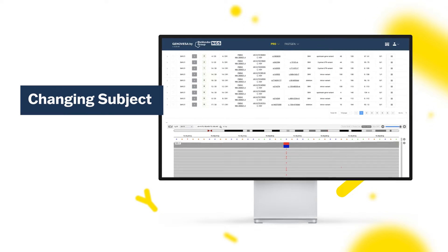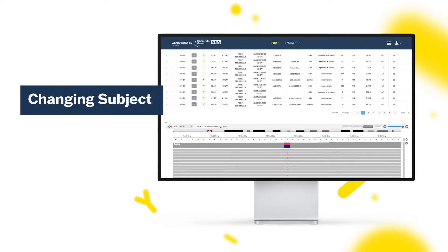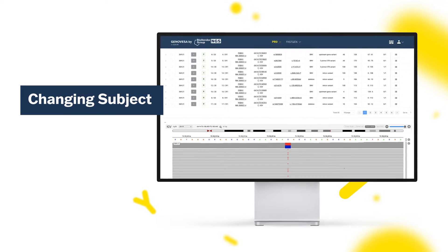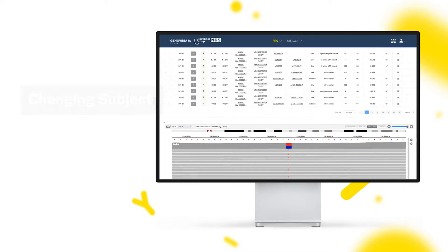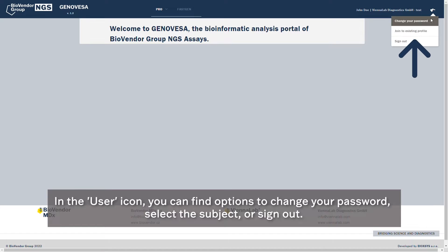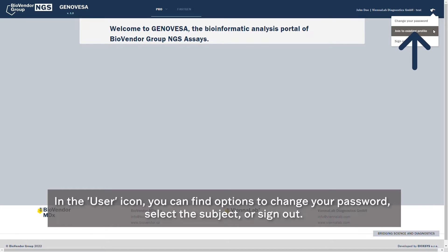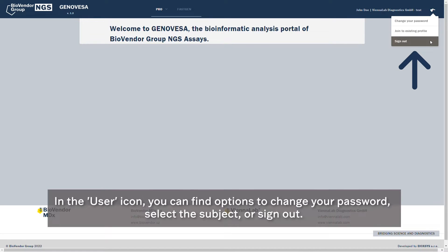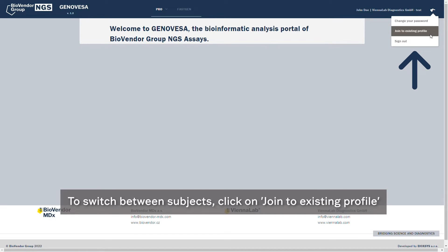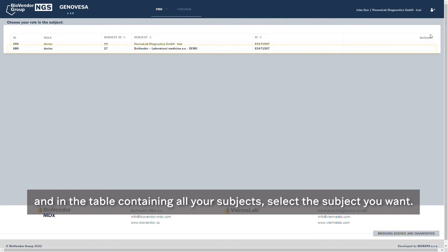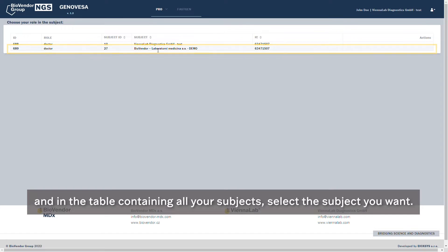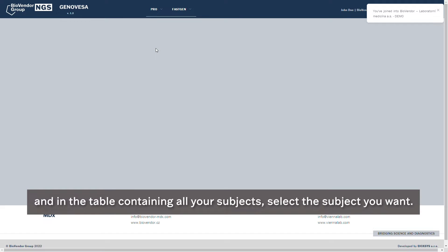Changing subject. In the role bar under the user icon, you can change your password, current subject, or sign out. To switch between subjects, click on Join to Existing Profile, and in the table containing your subjects, select the one you want.